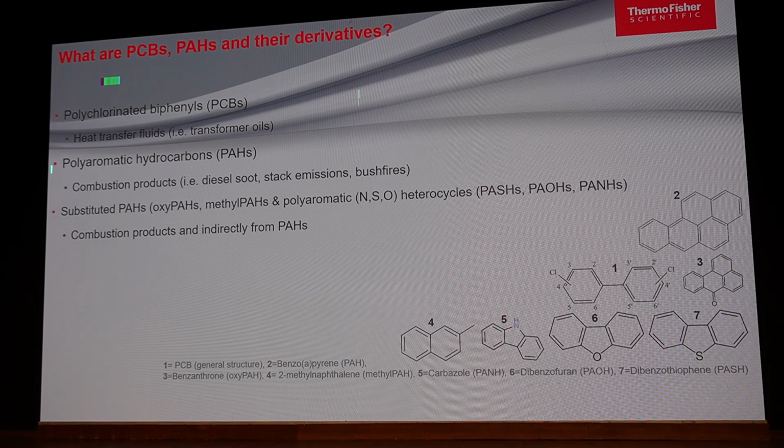How can that be analyzed using GC-HRMS, and what is the confidence level we keep to say that yes, these persistent organic pollutants are present in my samples, and how are we going to justify our results?